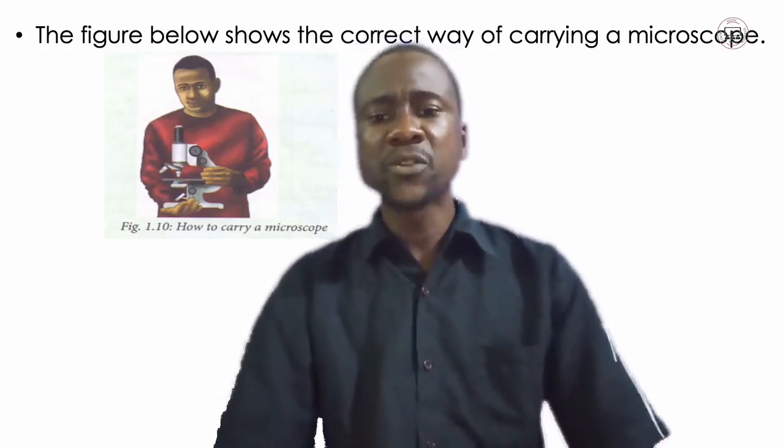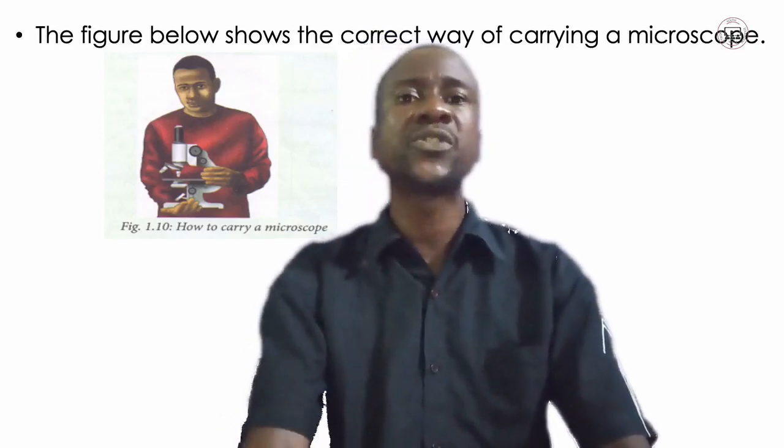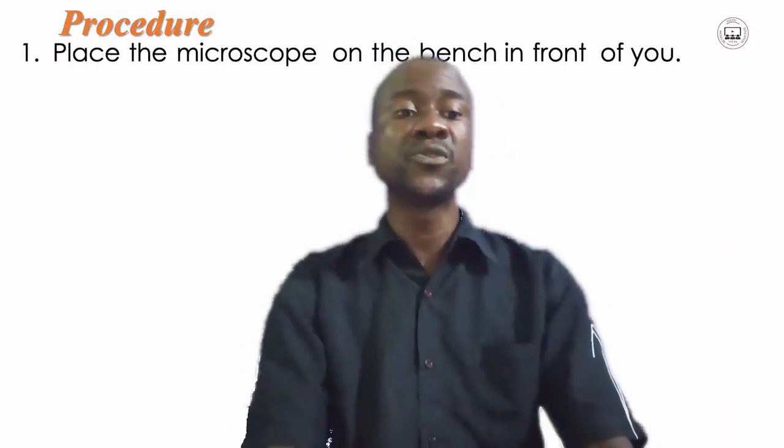Now, we have so far discussed the parts, the functions, and the proper way of carrying this microscope. But now, let us look at how we may use this microscope. Now we have the part on how to use a microscope. The materials that we might need are the same microscope and a newsprint. The procedures that you are supposed to take when you want to use a microscope.